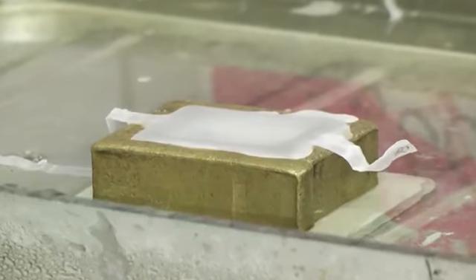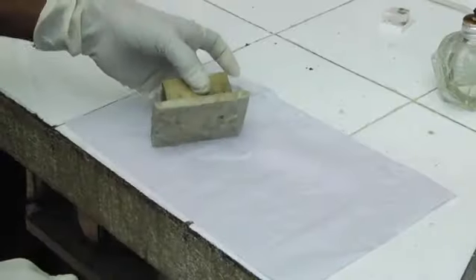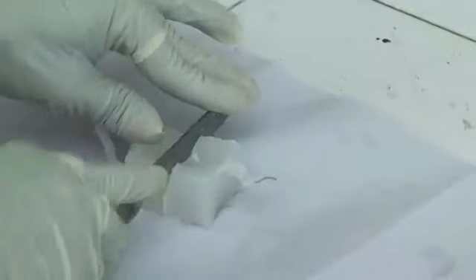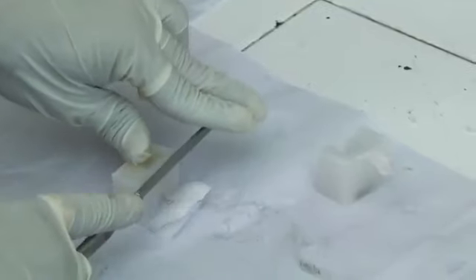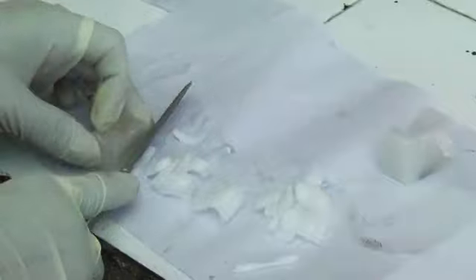The melted paraffin is allowed to harden at the room temperature. After hardening, the metallic molds are removed and the blocks are properly trimmed. Then, the blocks are kept in the ice chamber of a refrigerator for some time before cutting the sections.